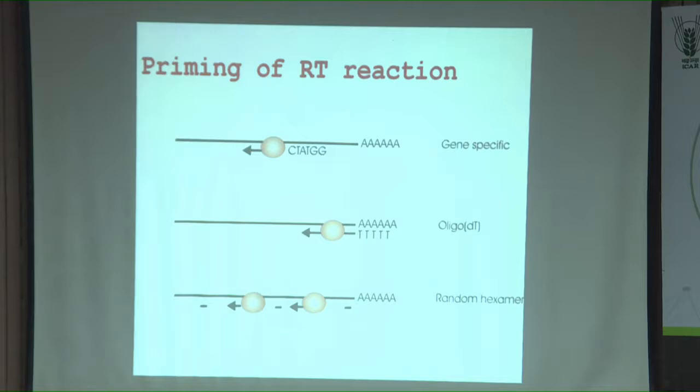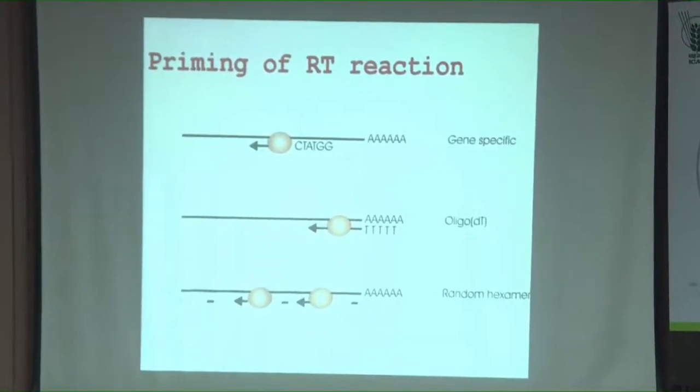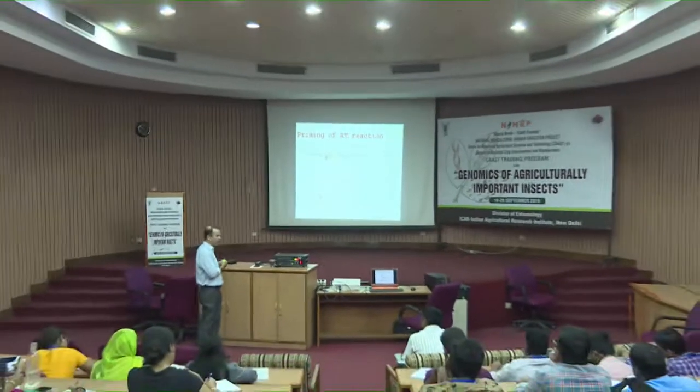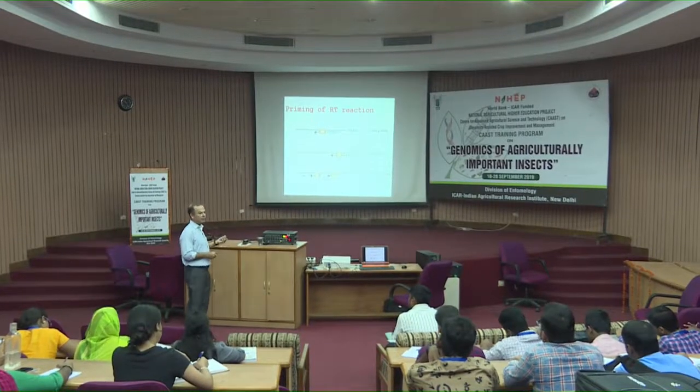then you can prefer to use an oligo dT primer. Oligo dT because we know that eukaryotic mRNAs invariably contain a poly A tail at the 3' end. So, it is generic in sequence, it is common across all the mRNAs. So, knowing that, one can use oligo dT as a primer, so that it binds to all the mRNAs in the isolation and then do the reverse transcription process. And many a times also where you do not bother to produce the complete copy of the mRNA, you can use random hexamers as a primer.